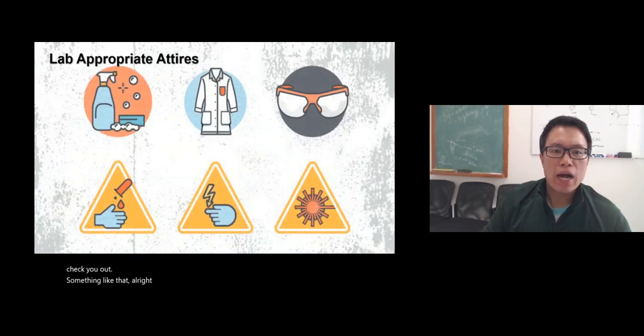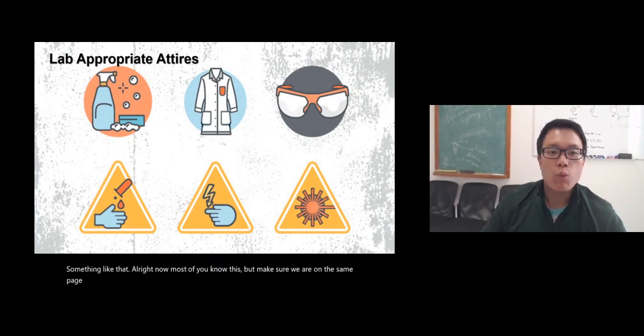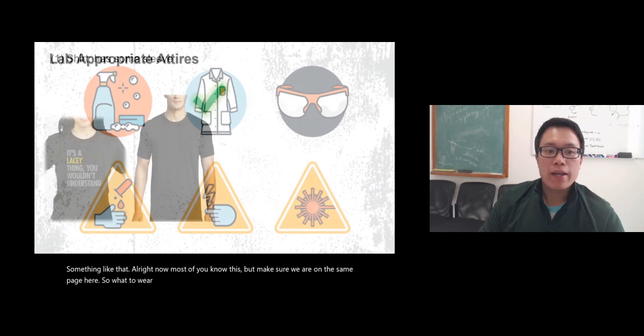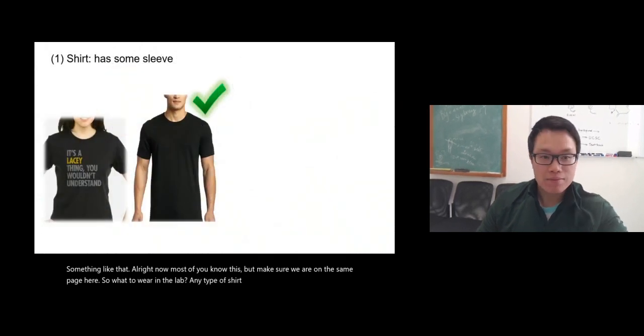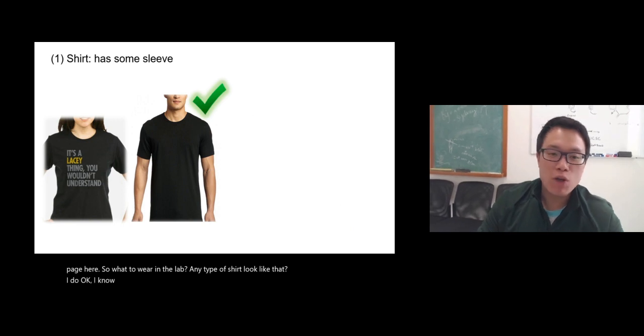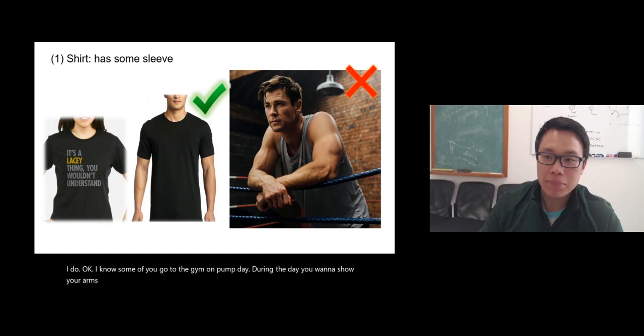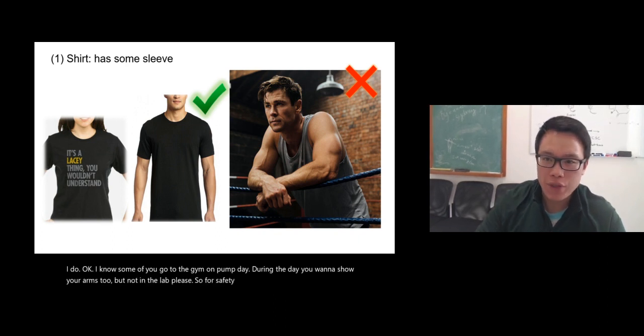All right. Now most of you know this, but make sure we're on the same page here. What to wear in the lab? Any type of shirt that looks like that is good. I know some of you go to the gym on pump day, arm day, you want to show your arms, but not in the lab, please, just for safety reasons. I think you guys know that.